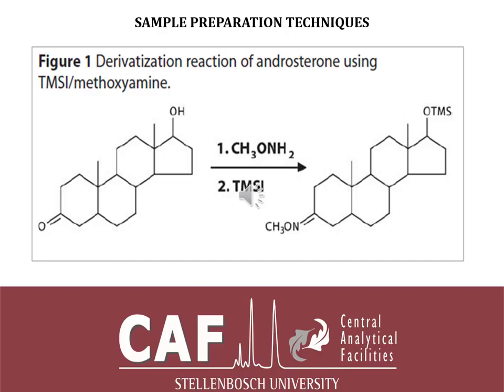the molecular weight. So it's important that when you look at the GCMS, you won't see the initial molecular weight; you're going to see an addition from the TMS. It's also important to bear that in mind.